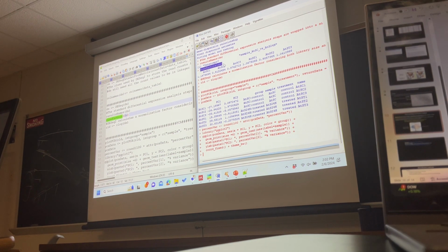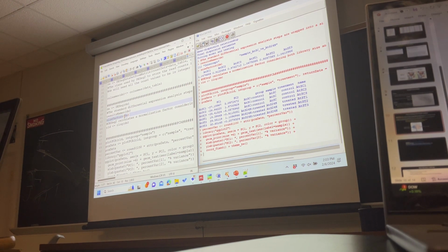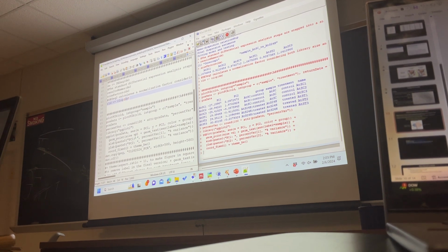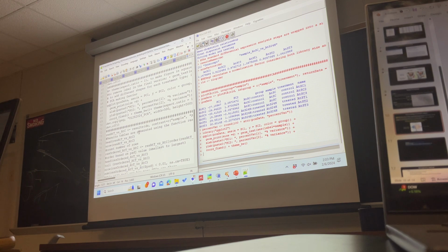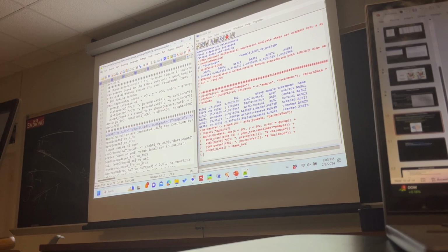How to calculate size factor in DESeq2? If you Google that, you will see all this process that I was describing here, but it's very clear in the manual. So we calculated the size factor, and then we did the PCA, but our job is to see the differential gene expression analysis. So this results function in DESeq2 basically uses this contrast function.